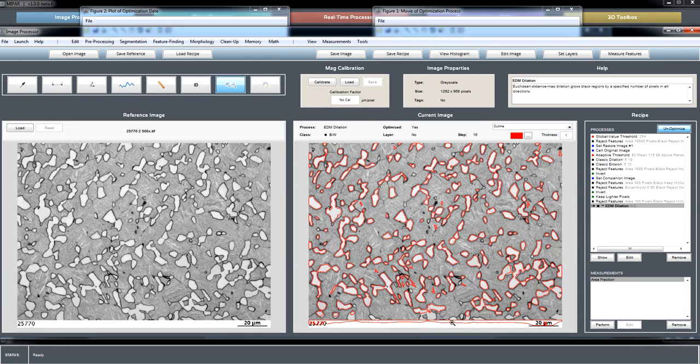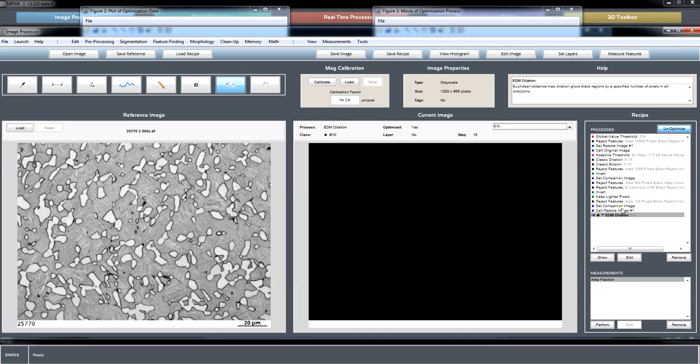Remember, we do also have this micron bar interfering with things, so very good point, Johan. That just occurred to me as well. Let's make sure that we take our image here at the end and set it as the companion, and then restore the, remember we set our restore image number 1 to be our mask here, and then do a keep lighter.